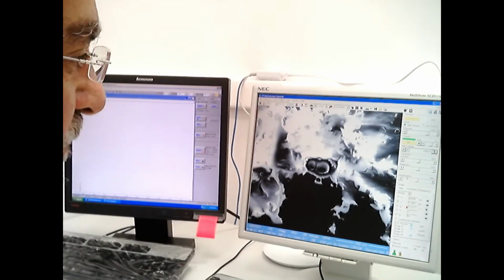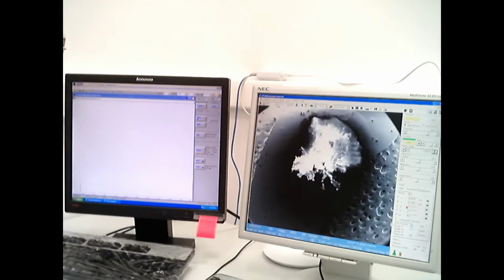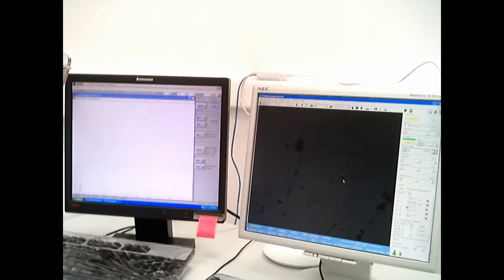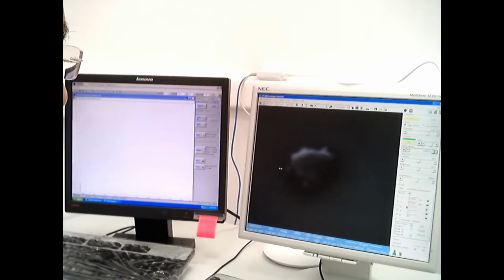This was on a piece of glass, so it could have been a piece of glass that broke during a fight or during somebody breaking in and things like that. So there's the glass over here. On the glass, there are also particles. Let's see if we can identify any of these particles. There is a tiny grain. Let's focus it a little bit. Unfortunately, it's not focusing very well. I haven't prepared the specimens very well, but it doesn't matter.